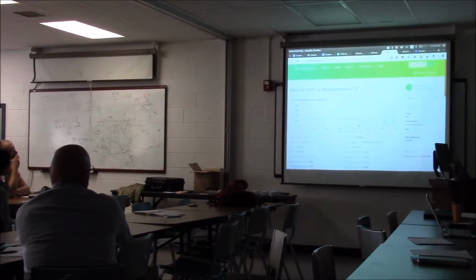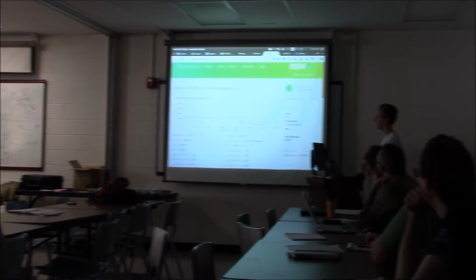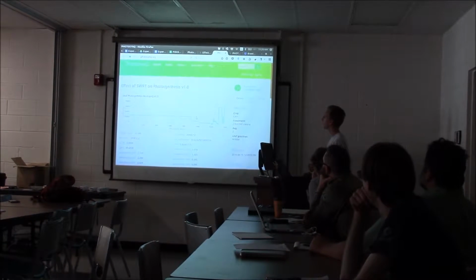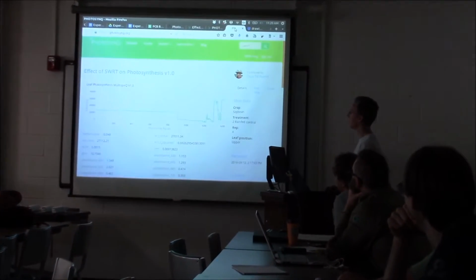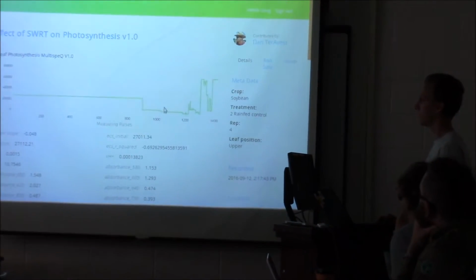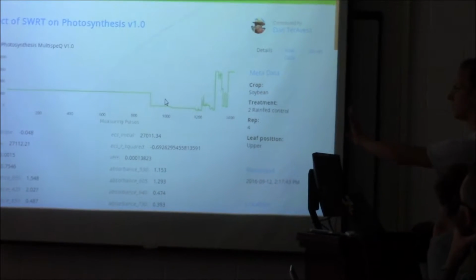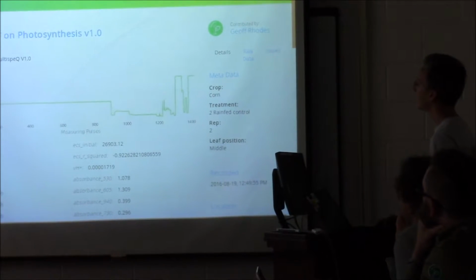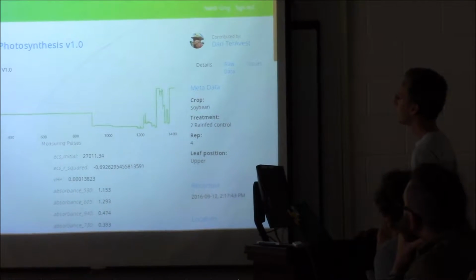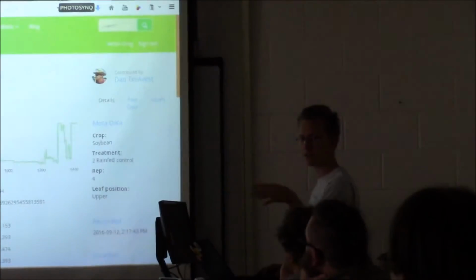So you can see here's a lower light. This is probably 100 microeinsteins. So this is a cloudy day, and you get a pretty big differential between FS and FM prime. And then here's high light. And all of a sudden it gets smaller because FS moves up. These are two different things. I'm just trying to show, this is generally, and when we go out and take measurements, you'll see that.